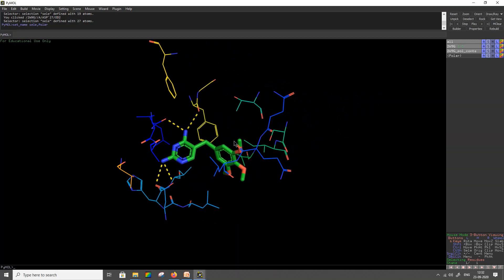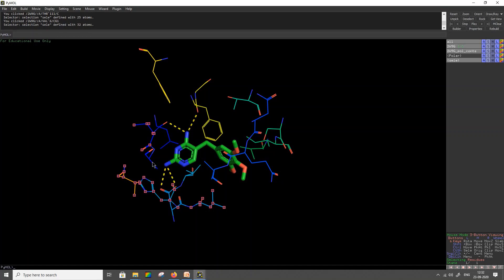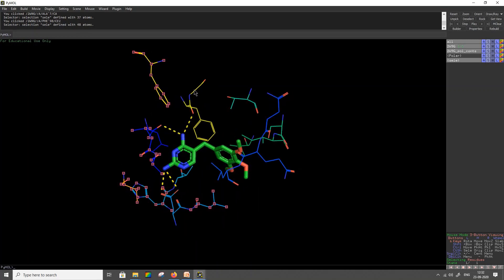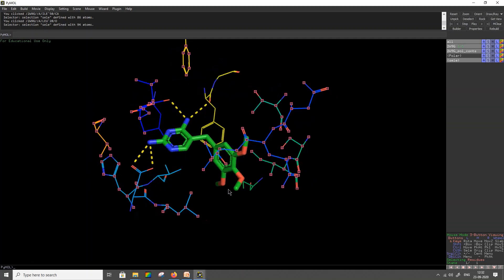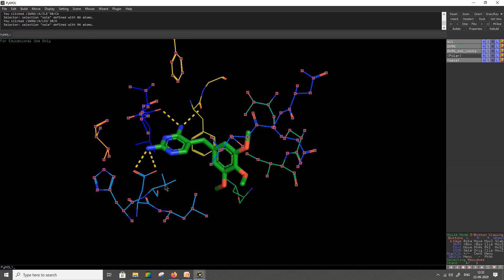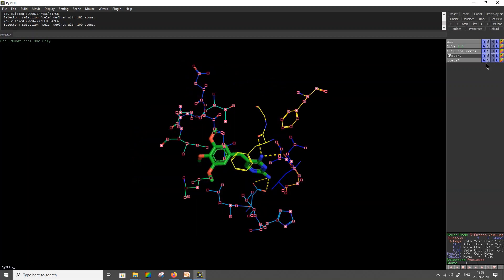Likewise, now select all the amino acids that do not form a hydrogen bond. Click on all the amino acids without a break — all of them will be selected in a group. I have now selected all the amino acids that are not forming a hydrogen bond. This can be categorized as a non-polar interaction. Label it as non-polar.